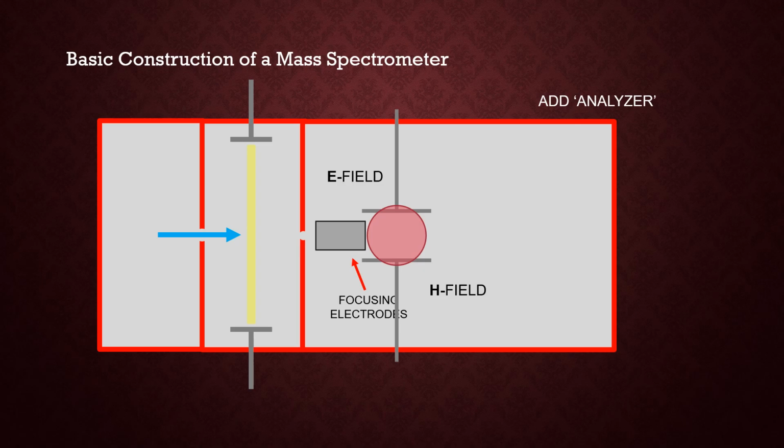And then all I need now is what's called a Faraday cup or a detector, where the ions are allowed to crash into and create an electric current when they do so. So by knowing the dimensions of my box and playing around with the electric and the magnetic field, I can focus the ionic beam onto the detector, the fancy name for which is a Faraday cup, and I can measure the current, knowing that the beam is now striking it.